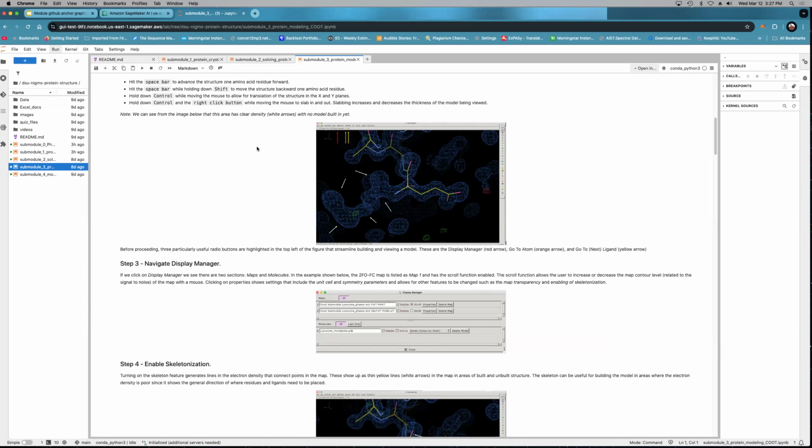And of course, if you go to deposit your protein ultimately in the Protein Data Bank, there will be a check there, part of the validation process of running a Ramachandran plot, which you probably should be doing anyway. And it'll let you know if some of the phi and psi angles are off so you can correct them. Sometimes they will be, sometimes they're in the forbidden zone or the generously allowed region, what they generally call it. And that could be okay if there aren't that many, or if it's in a region of poor density, or that particular residue is involved in part of the enzyme mechanism that's under strain.